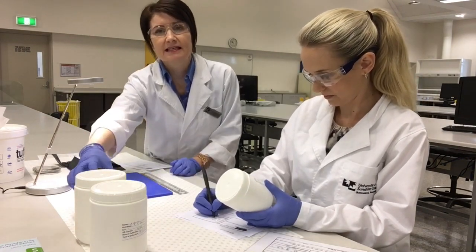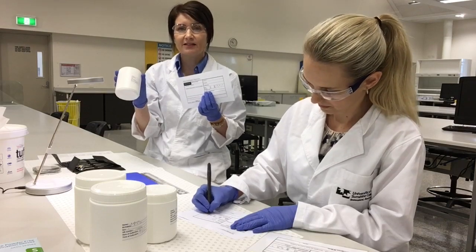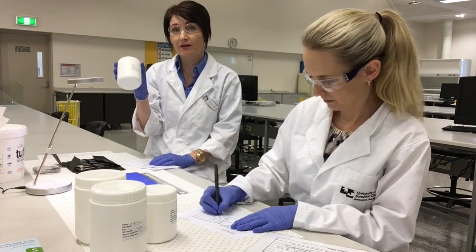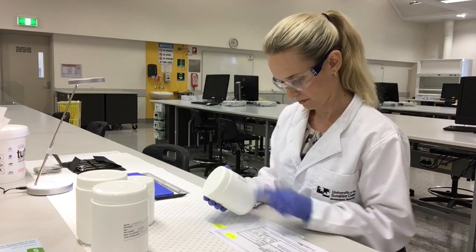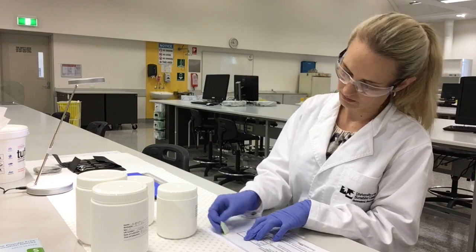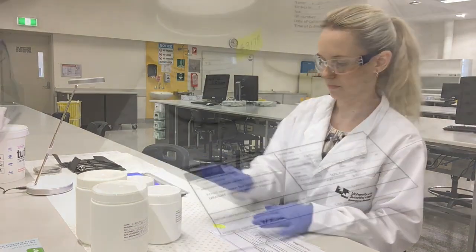Tissue specimens are received in the diagnostic pathology laboratory, and they come with a request form that lists the patient information and the history about the patient, along with a description of the tissue that came from the patient's body. After the patient details have been identified with their name, date of birth, and identification number, the specimens are accessioned by giving them a lab number that is unique for each patient and will identify each specimen for the patient in the histology laboratory.